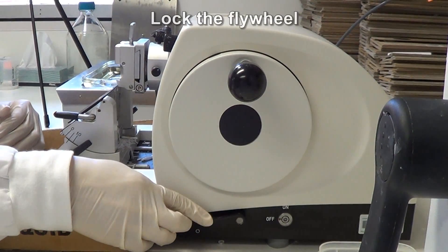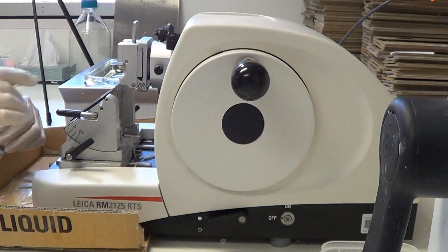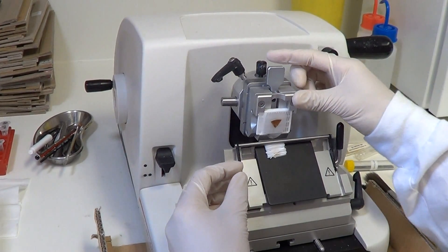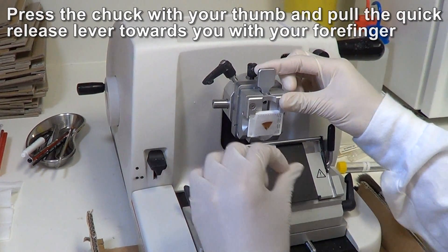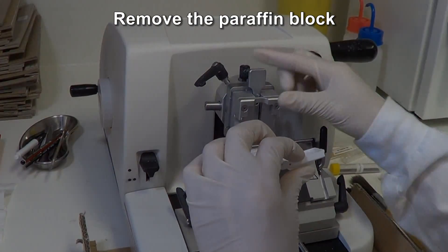Before removing the block, lock the flywheel and raise the knife barrier. To remove the paraffin block, press your thumb against the chuck. Draw the lever towards you with your forefinger and then lift the block out of the holder.